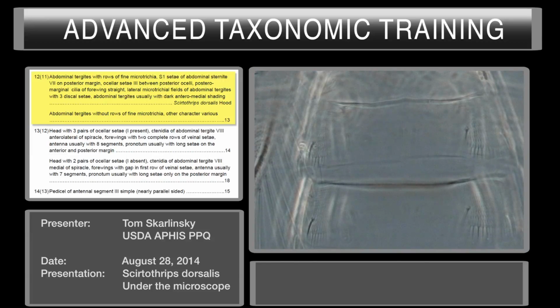But we do have Scirtothrips dorsalis, and thank you very much.